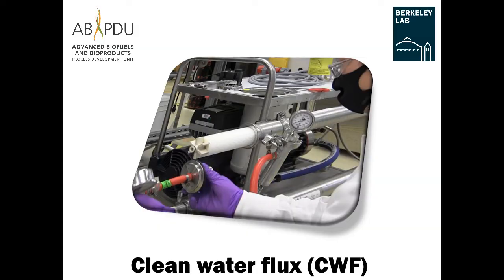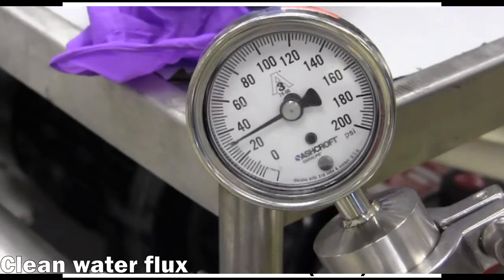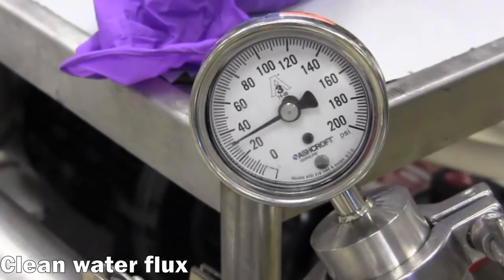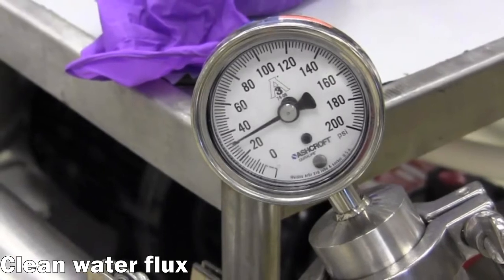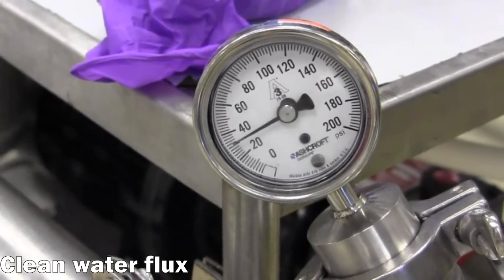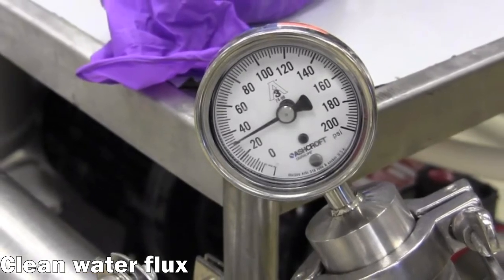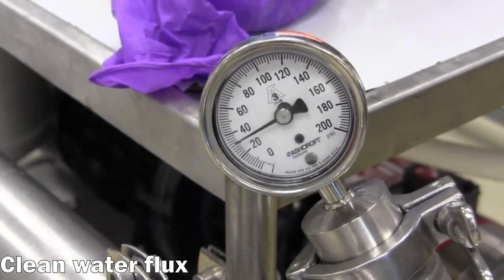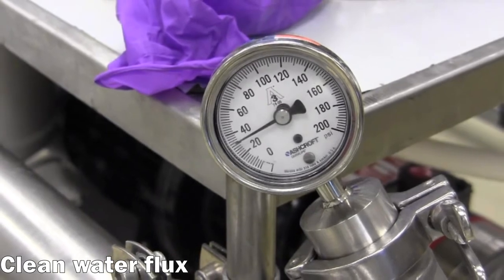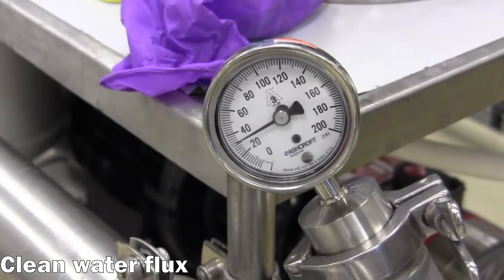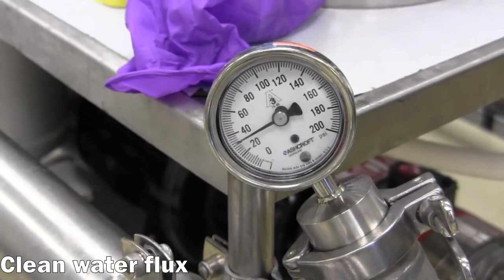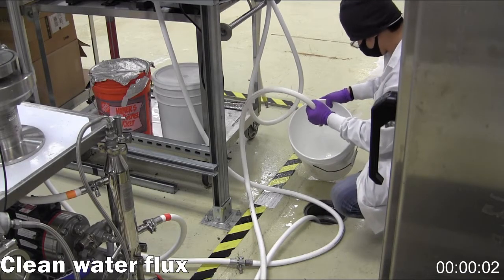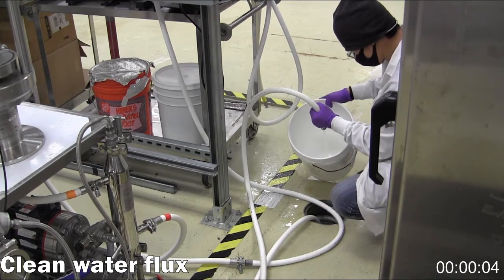Clean water flux: Now that the membrane is cleaned, a test is conducted to verify the clean water flux is within the manufacturer's specifications and that the membrane is behaving as expected. It is also useful to record this value over subsequent processing runs to monitor degradation of the membrane over time, after which it must be replaced. The clean water flux is measured by collecting the permeate stream for a given time period, such as one minute.